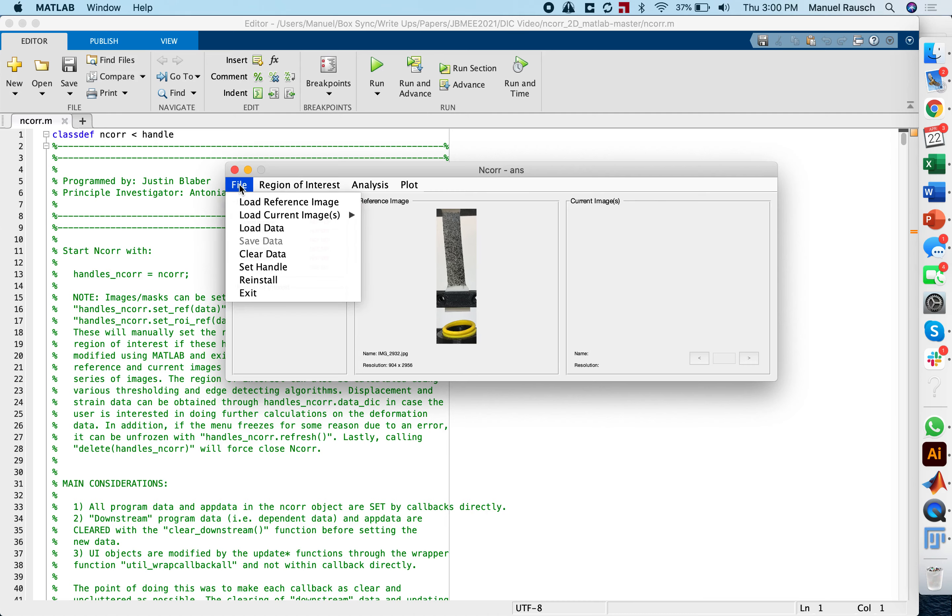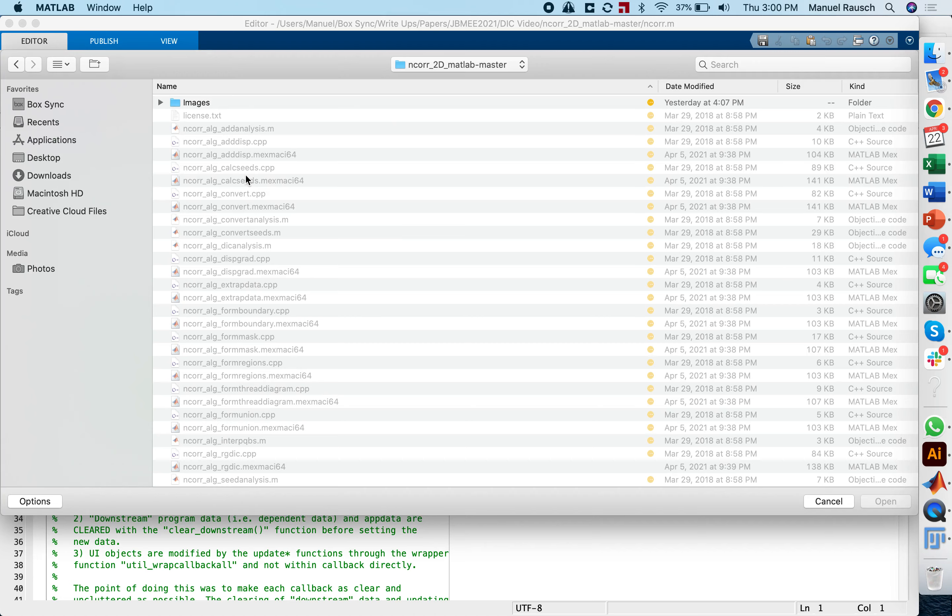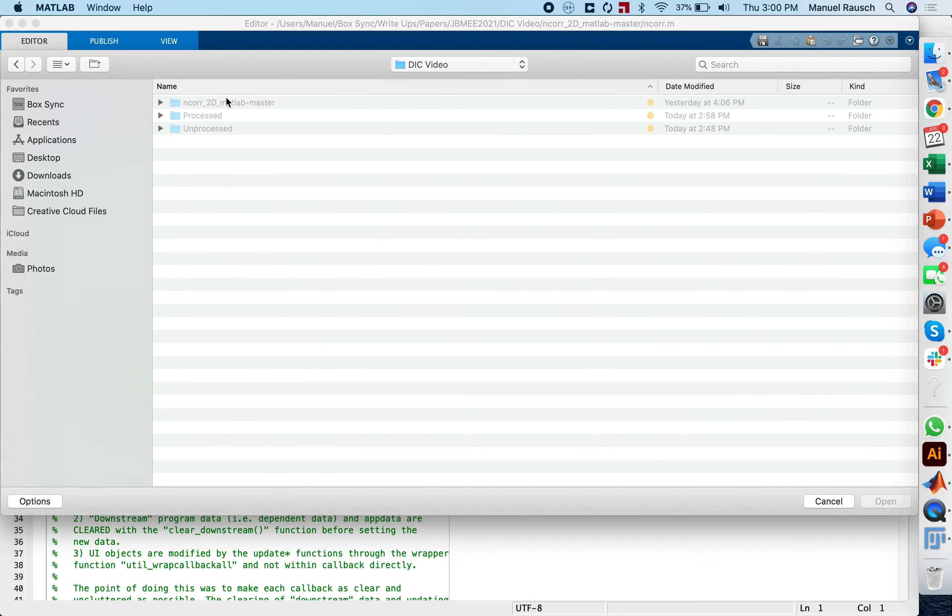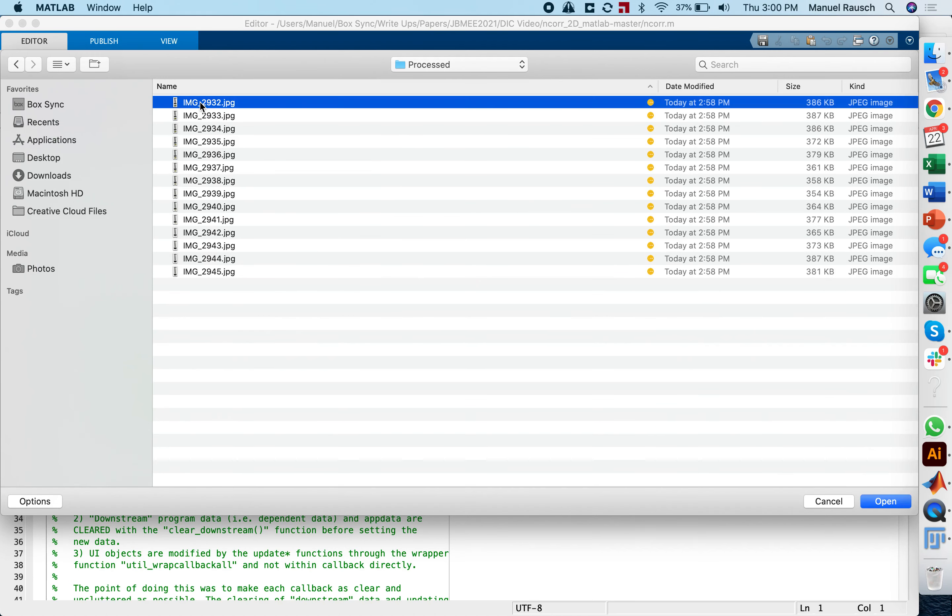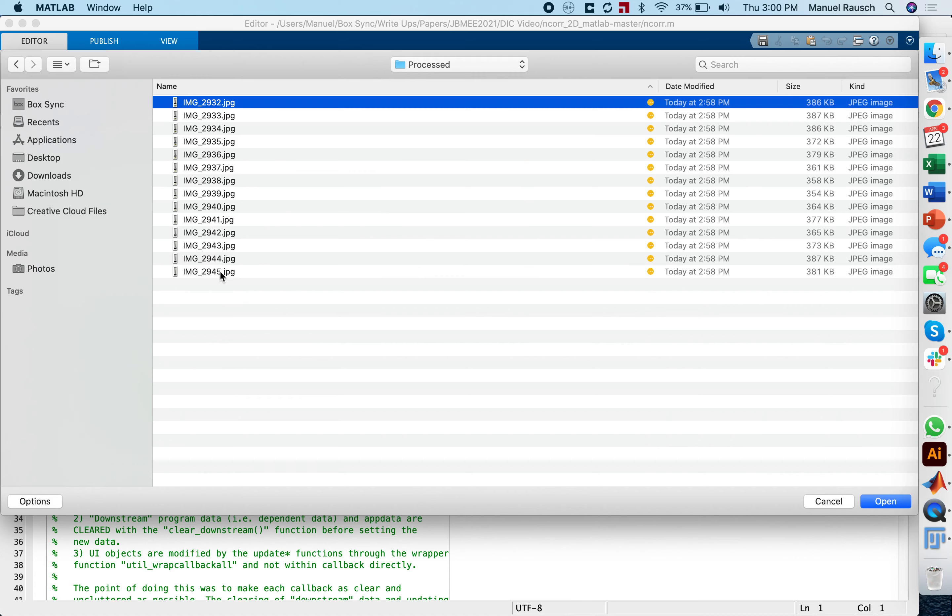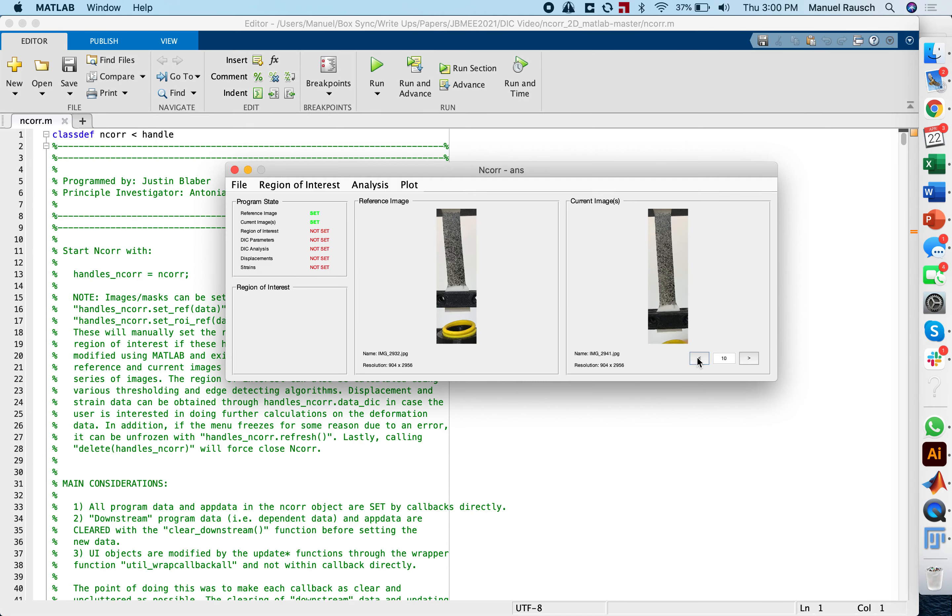The next step is to select the current images. I go back for the processed images. You want to make sure that you also include the reference image. So I load all these images. You can see down here, we took a total of 14 images. Here you can sort of go through them and make sure that all the images are there.